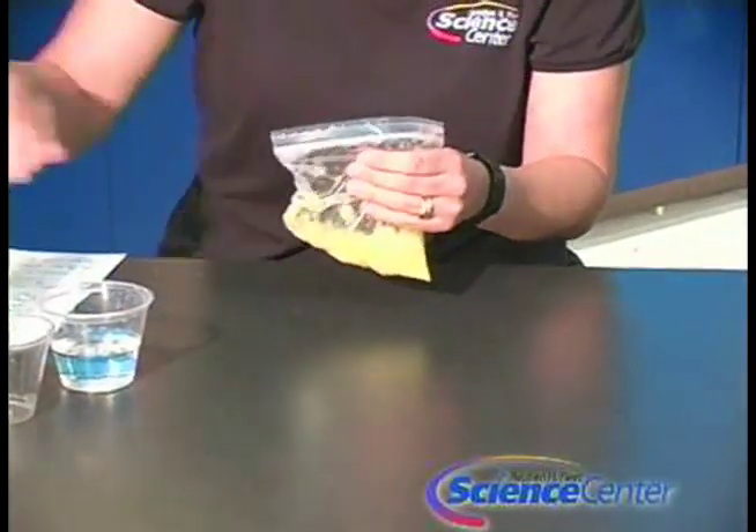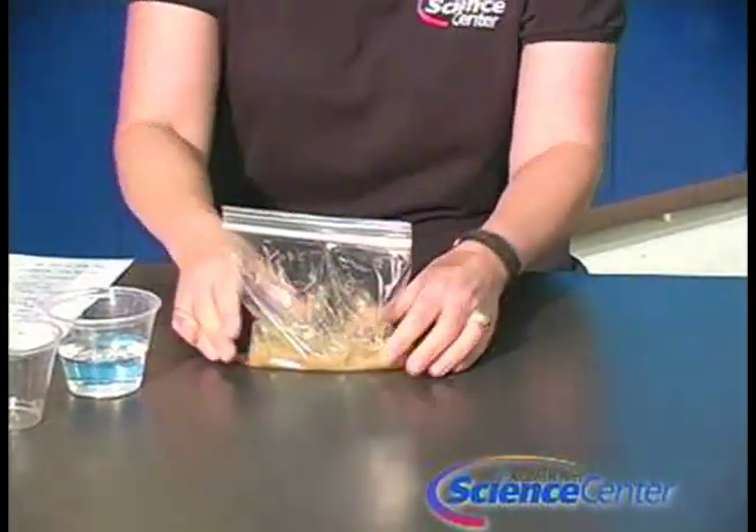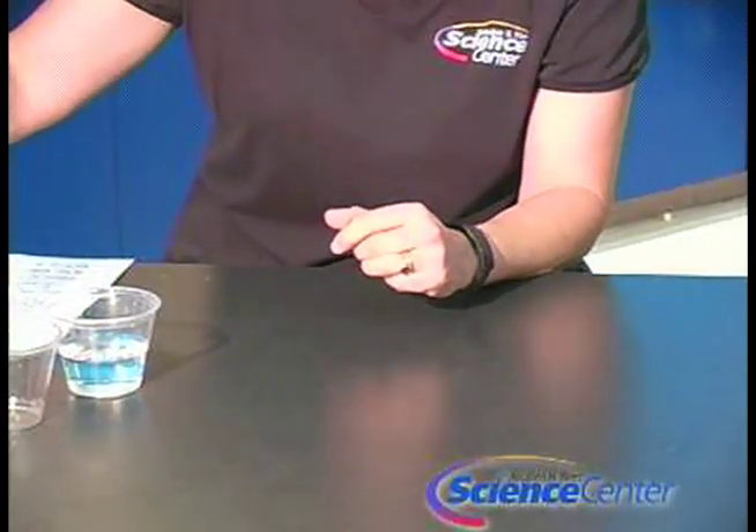I've made one right here, and this is what it's going to look like after you've squished it up very finely. We're going to put this aside and use it for the next step.